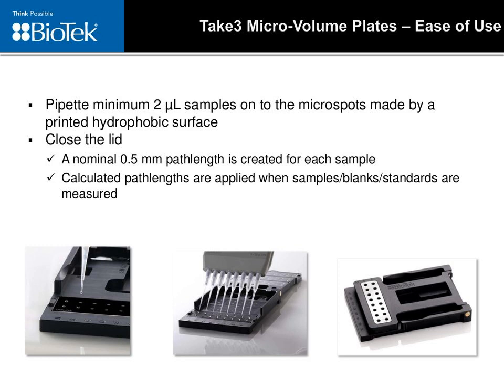Additionally, when performing assays requiring reagents being added to the samples, using a multi-channel pipetter can help to ensure that the reaction times are equivalent across all microspots. I'll discuss specific applications in greater detail in the following sections.